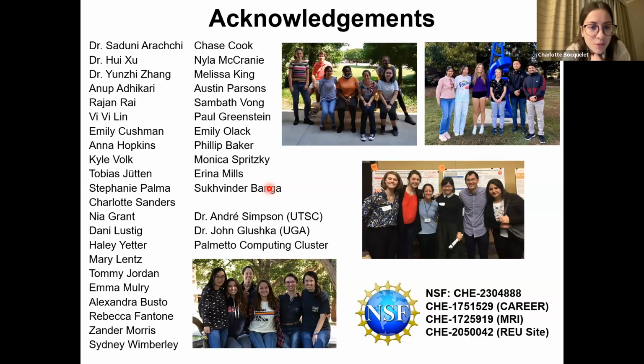We have a question from Nesrine in the chat. Thanks for this very interesting talk. Regarding the water samples, could you explain the methods you use to ensure the absence of pollutants, such as paramagnetic substances that might impact the relaxation or control the experiments?